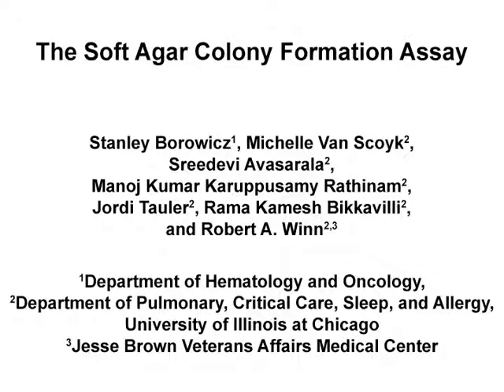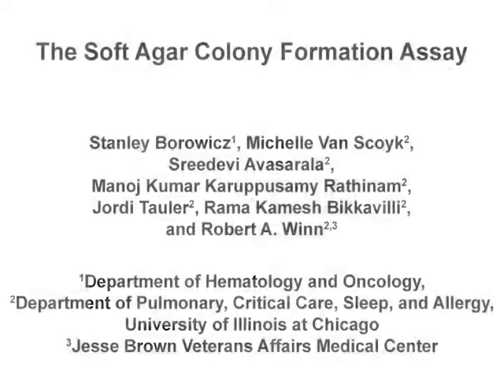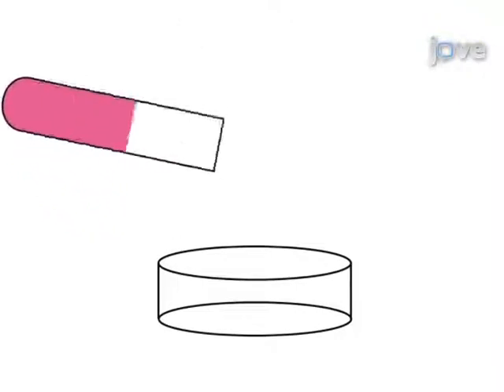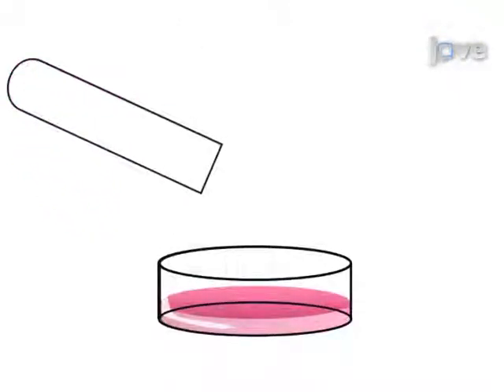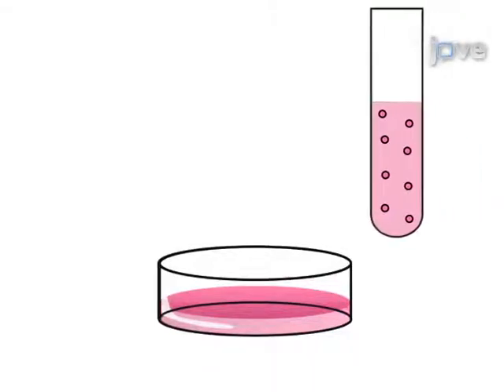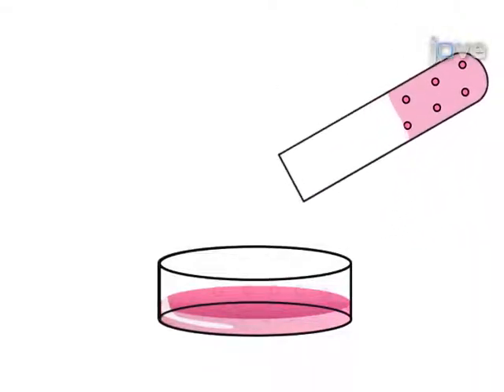The overall goal of this procedure is to quantify cellular anchorage independent growth. This is accomplished by first plating a layer of agar onto the cell culture plate and allowing it to harden. The second step is to plate a mixture of cells and agar over the top of the previous agar layer.